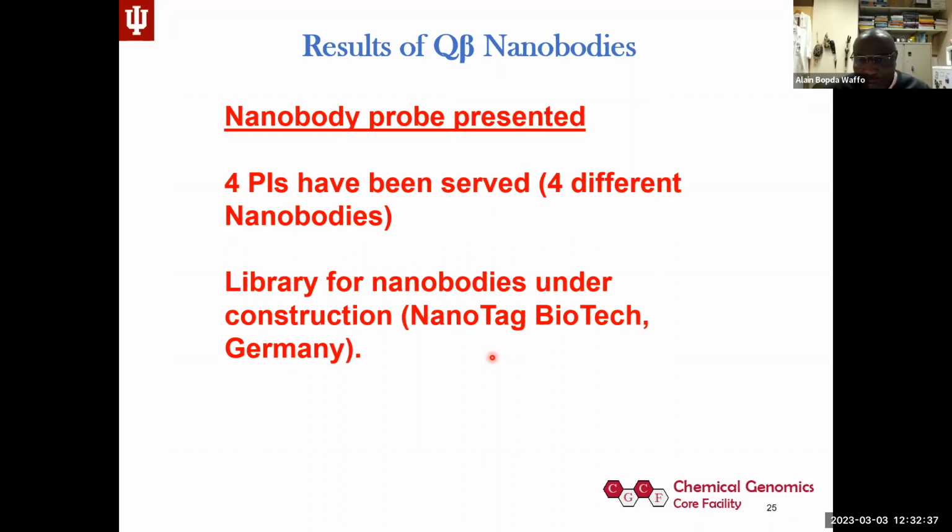So just to cover the 4th part. I didn't want to go into a lot of specifics, but this is what we're doing. This is what we can do with the 2 types of phages, not just the selection from the library. We can construct your own library. We can present your own target. We can design anything going to the target. Or if you have the target and you want to map some of the amino acids, we can go to that level. We can make different mutations of the motif to tell you what are the best or the key amino acids involved in your interaction.